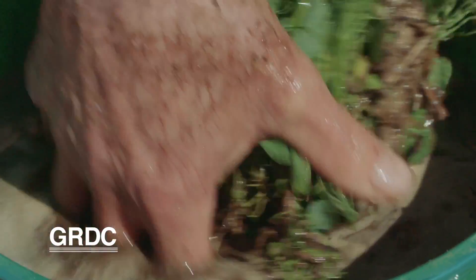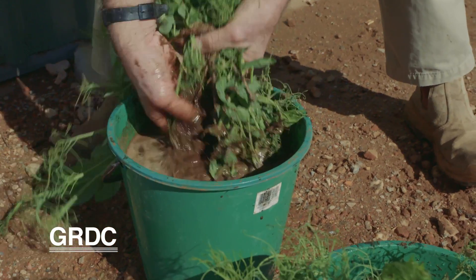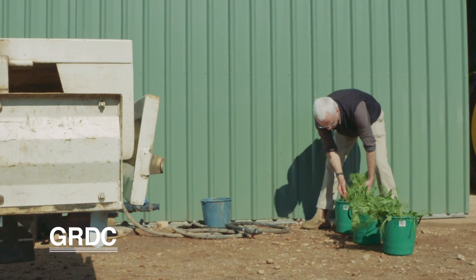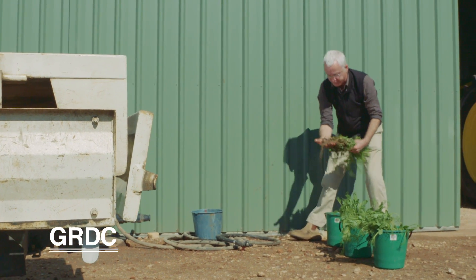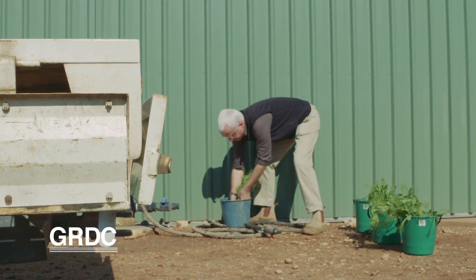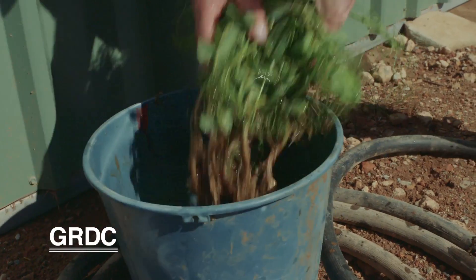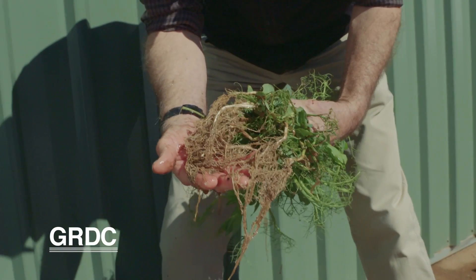Now that's been soaking for a bit and the plants are coming away nicely. We've got most of the soil off but we do need to rinse just once, so we'll go over to another bucket and rinse. Just one rinse is usually enough — now we've got our rinsed root systems.